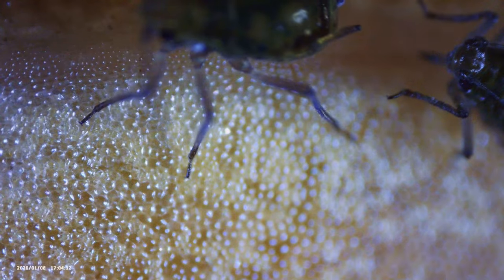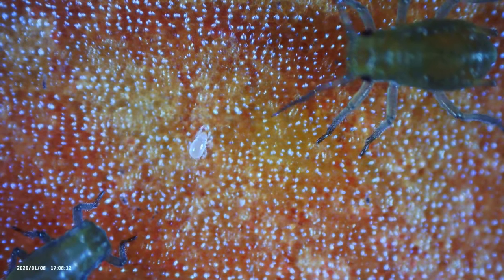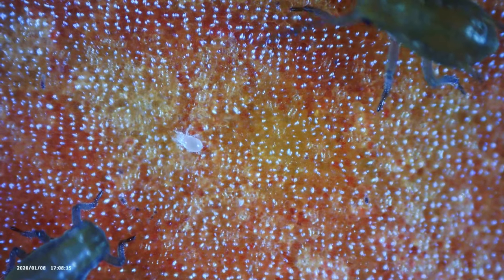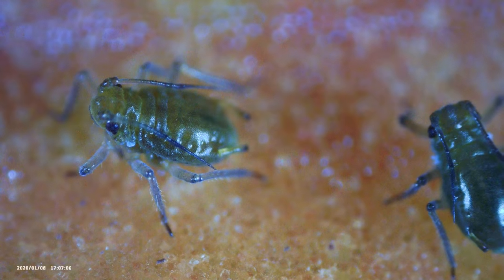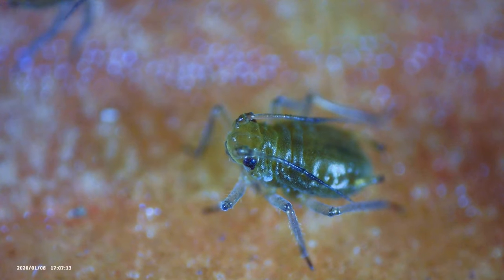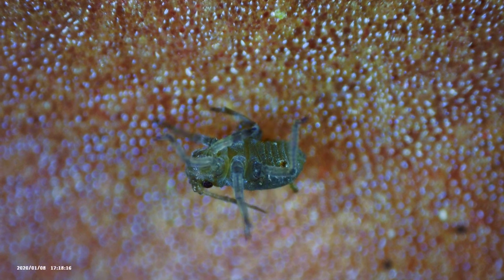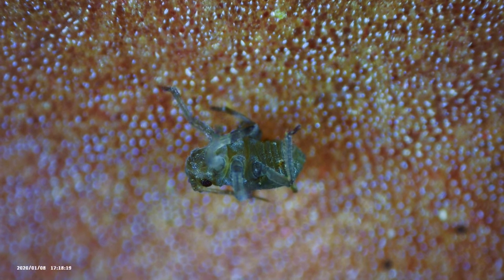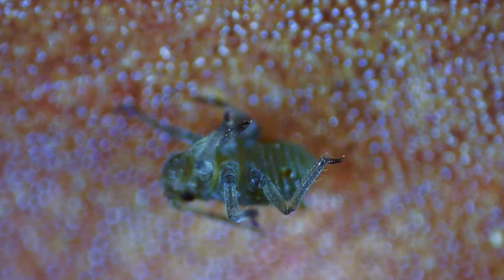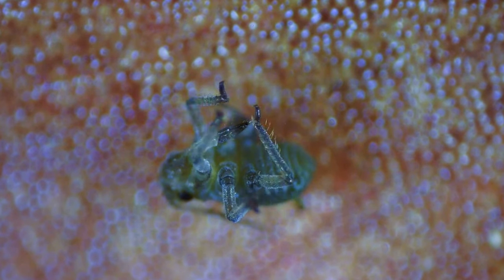This video is mostly just an identification video, so once you identify your pest you can go find methods that work for you. The more I looked at these aphids the more I thought they were cute — especially the little baby ones, with their rotund body and little antennae. They also have a sucker they use to damage your plants and suck all the juices out. You can see that on this one I've flipped upside down — they almost look like little turtles, though it doesn't seem like they can flip back over.